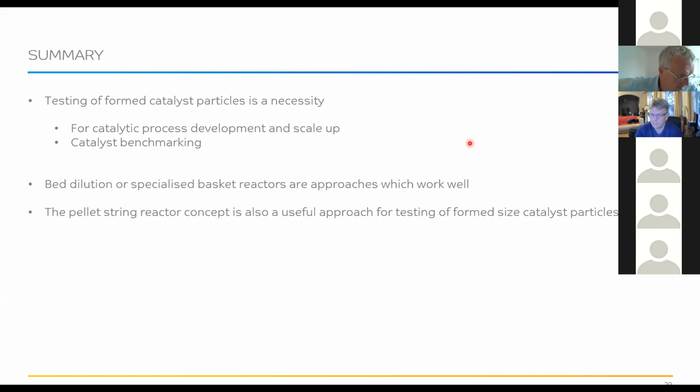One from Nikolai. Could you possibly comment on heat transfer? The larger scale reactor is much more challenging. Does it mean the small scale reactor provides the best case results? In terms of wanting isothermal behavior, yes, but even with small scale reactors, it can be challenging to remove the heat, particularly for an exothermic reaction, particularly if you go up above a reactor diameter of a few millimeters.